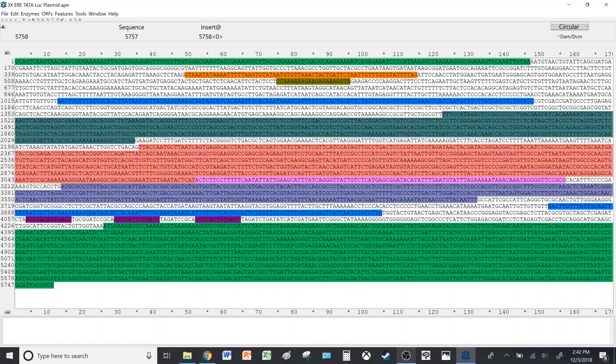We'll also cover creating maps without restriction endonucleases as well as utilizing the digestion tool, which basically predicts the number of bands that will be present on an agarose gel if you run an electrophoresis after a restriction digest.